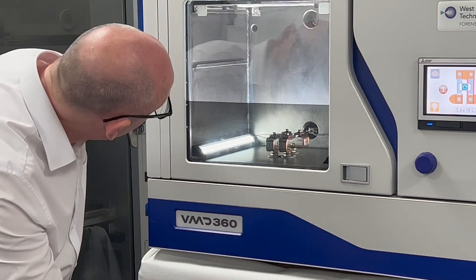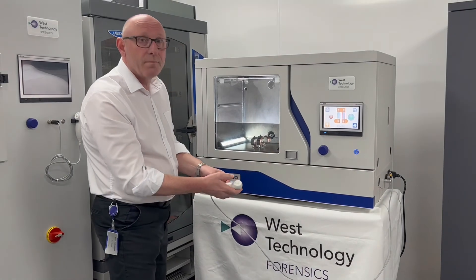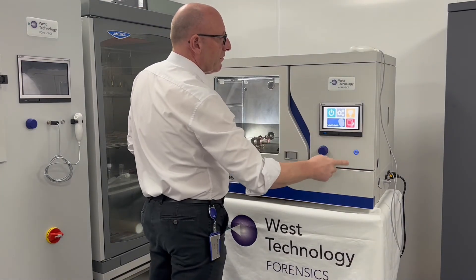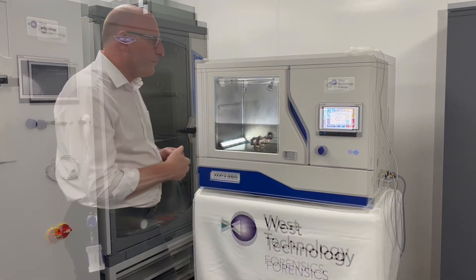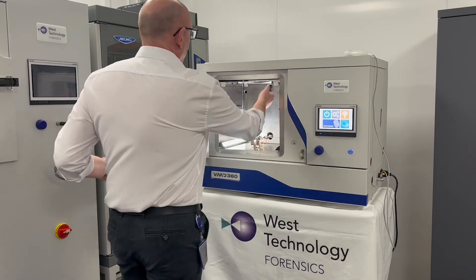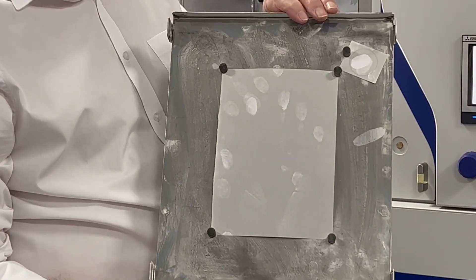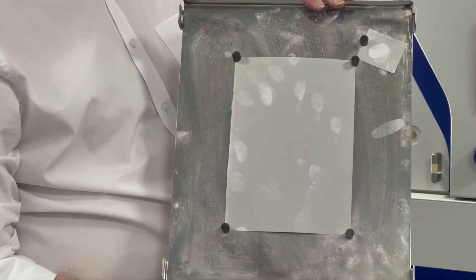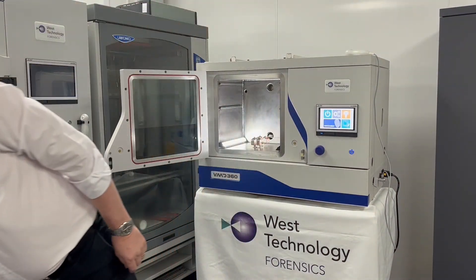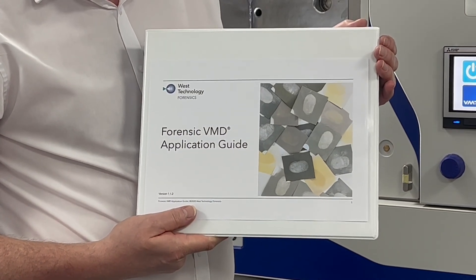We've put some zinc onto the exhibit and it looks like it's developed some latent prints. I'm going to stop the process and take the exhibit out of the chamber. We open the door — the process is finished. I'll bring our evidence out and we've managed to process some latent prints on our evidence. To help our customers, West Technology produces an application guide which gives all the metals that should be used on different types of exhibits so you get the most effective processing.